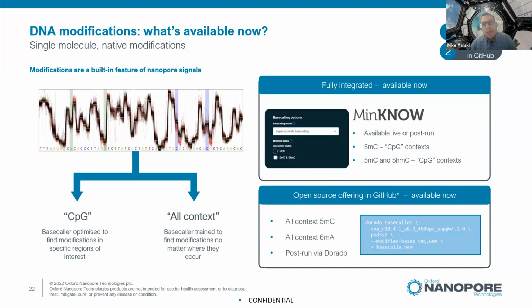And the other thing, I guess, that's not on this slide is that if you are a developer and you want to look at modifications that are not in our pipeline, you can register on our website. There's a beta tool release that you can register to access. So this is proprietary ONT knowledge. So you have to register your access to it, and then there'll be some exchanges with our developers, and then you might or might not get access to this. But if you really are looking at modifications that are outside of ours, we are willing to work with you. So please register your interest on that website. You can see that announcement in the community under updates.